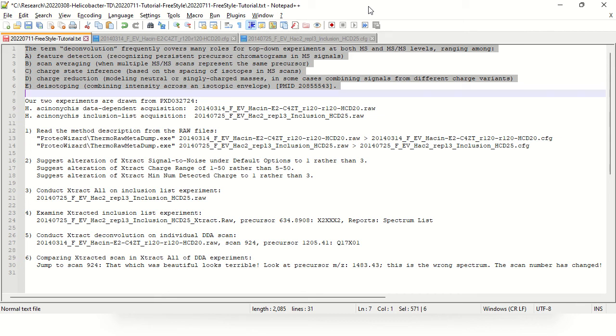So in the bottom-up world of proteomics, we don't typically deconvolute our spectra, which means that if we're trying to identify a +2 version of a peptide rather than a +3 version of a peptide, the fragments we predict to be present in the tandem mass spectrum differ, even though it's the same input sequence. The reason for this is in a +3 spectrum, we must consider the possibility that each fragment appears at either +1 charge or at +2 charge.